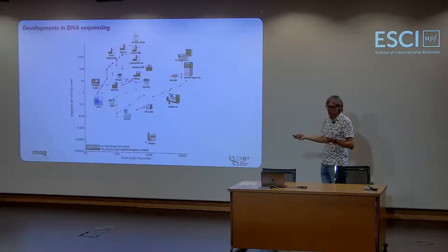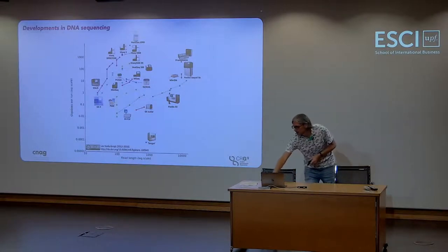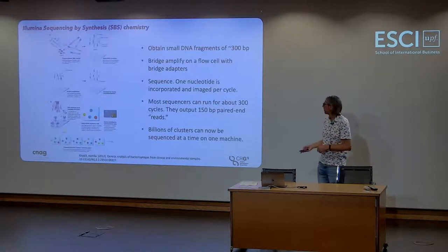Illumina comes along. First was Solexa. It was bought by Illumina. And it's a very similar idea, using a DNA polymerase to synthesize DNA with labeled nucleotides, but stopping it after every cycle. That's on the next slide. I think I'll just show it right there. Okay.